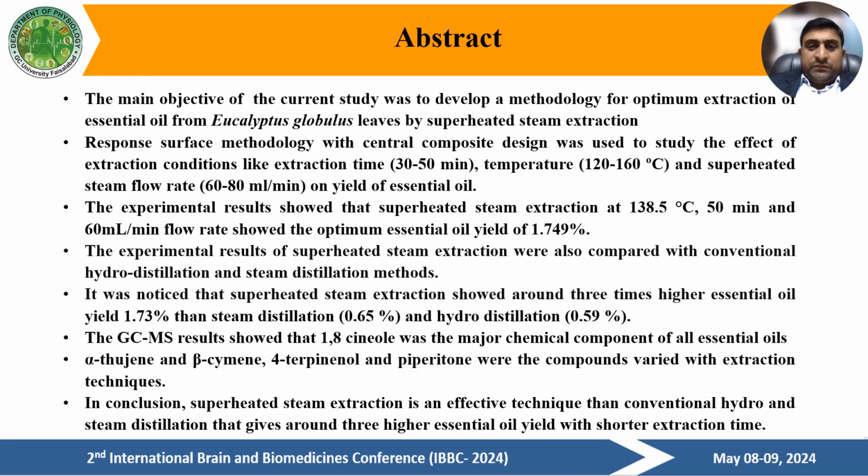The main objective of the current study was to develop a methodology for optimum extraction of essential oil from Eucalyptus globulus leaf by using superheated steam distillation. For the optimization of this methodology, central composite design was used to study the effect of extraction conditions like temperature, time, and superheated steam flow rate on essential oil yield.